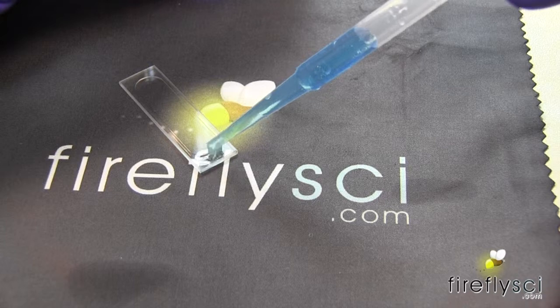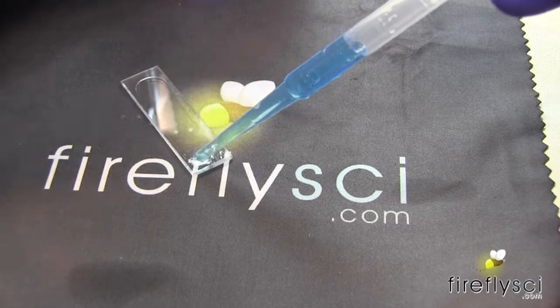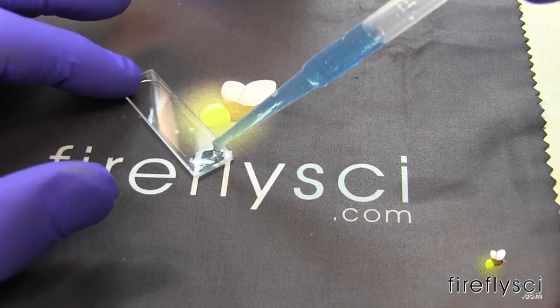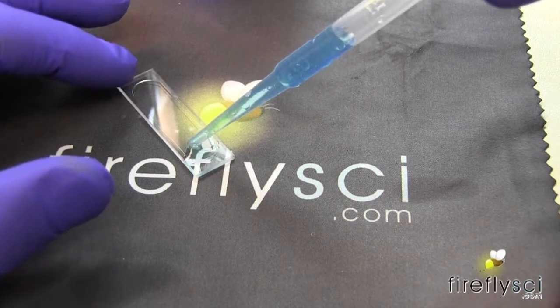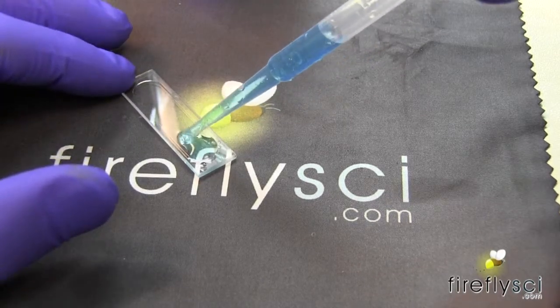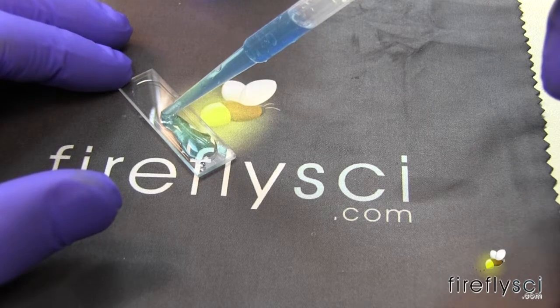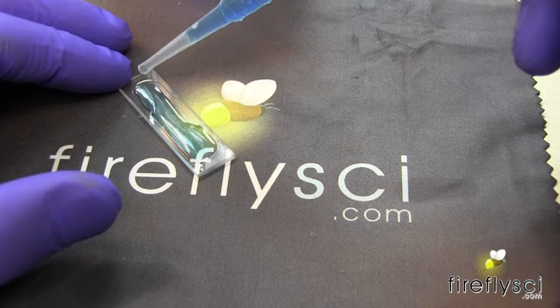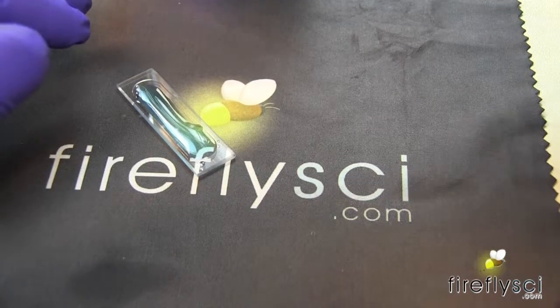And again, you do want to make sure that it is wet on these edges or these raised edges. You want to make sure that the sample gets on those edges or else you're going to have leaks if it's not wet enough. Okay.